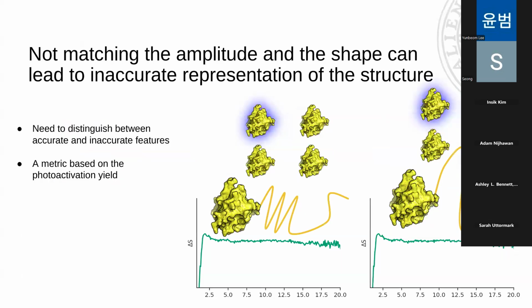So the important part was that we need to take this into account when we do our modeling, because we want to model the movement that we're watching accurately. So we want to know, are we seeing, you saw a mistake here, but the idea is that we have many molecules and a short movement of the helix, just semi-unfolded, or vice versa. We will have a huge movement with few molecules excited. As you can see, this should be swapped around. And this could give the same signal in theory. So we want to be able to discriminate this and find which one is represented in the sample we're looking at.